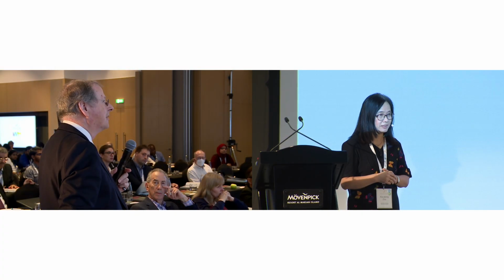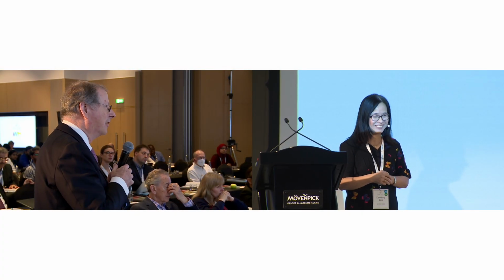Usually you can figure it out. And if you have more complicated diffuse scattering, one of my colleagues is developing what's called the 3D PDF to extract the 3D data, including the diffuse scattering, to study the disorder. So I was thinking of 3D PDF. Yes, that would be fantastic. Okay, thank you very much.